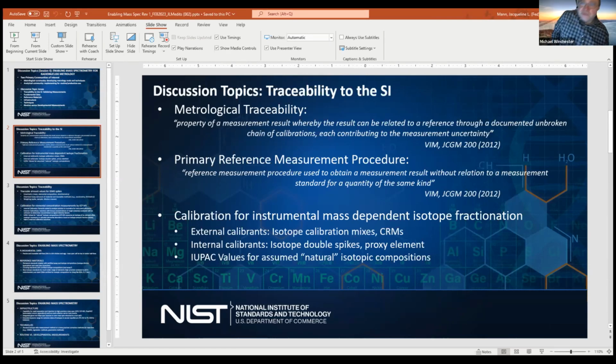Actually, Mark sort of stole what I was going to say, but let me say it a different way. At least in the CCQM space, in the late 90s or so, maybe the early 2000s, the CCQM defined primary method and distinguished between two different types, primary direct and primary ratio.